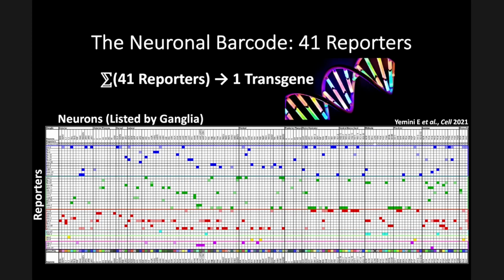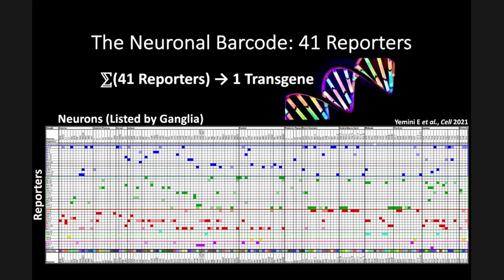We break apart their DNA, and sometimes the worm's cellular machinery for DNA repair is basically like, oh no, what happened? My DNA is fractured. And in reassembling it, they take up the transgene and then put it in. They're like, oh, this belongs inside me, I guess. I'll just put it into my genome. And now it's integrated. And now it's expressed in all worms, and it's not lost because it's in one of the worm's 6 chromosomes. And all those worms look alike. So I inserted this transgene into multiple locations on different chromosomes, and all those worms looked alike.